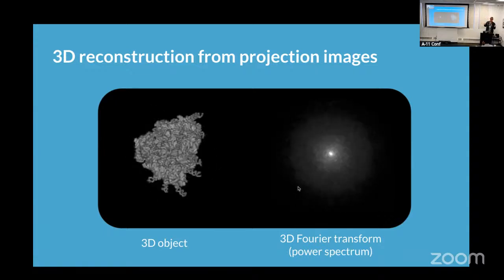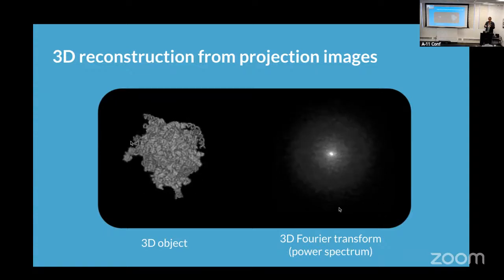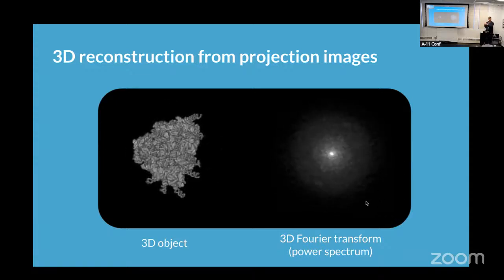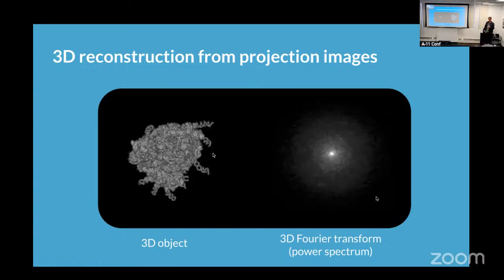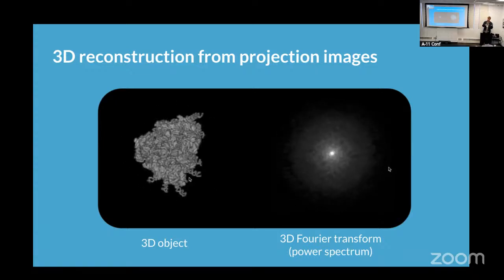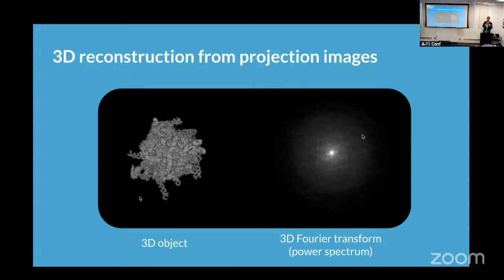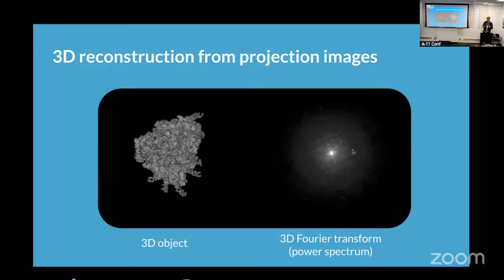This is very similar to when we think about sheet music. We don't think in terms of waveforms of the sound. We think in terms of the frequencies of the notes that make up the sound that is playing at any one moment. And sometimes when we're doing image analysis, it's useful to think in terms of the high and the low frequency information. Maybe we trust the low frequency information more in our images than the high frequency information because it's less noisy in those regions. Okay?